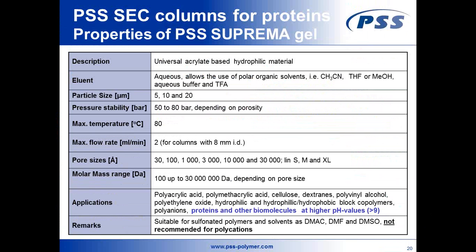You can also improve the Suprema or the polymer-based resolution by reducing particle sizes further in order to reduce the interstitial volume. This is what we do at the moment, and we will shortly come up with smaller particle sizes in order to be comparable to the silica-based material also on the polymer-based side.